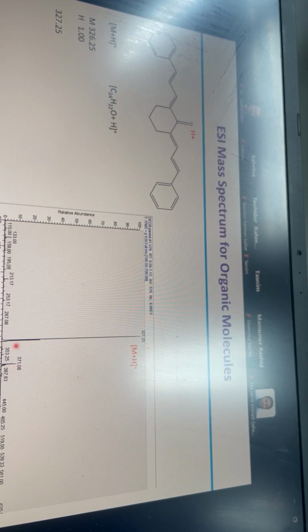You see a tiny bit of something else. It may be some sodium adduct, but its abundance is less than 10%, very tiny. You just see one beautiful peak, because of his contribution of making this new method. So he got the Nobel Prize in chemistry.